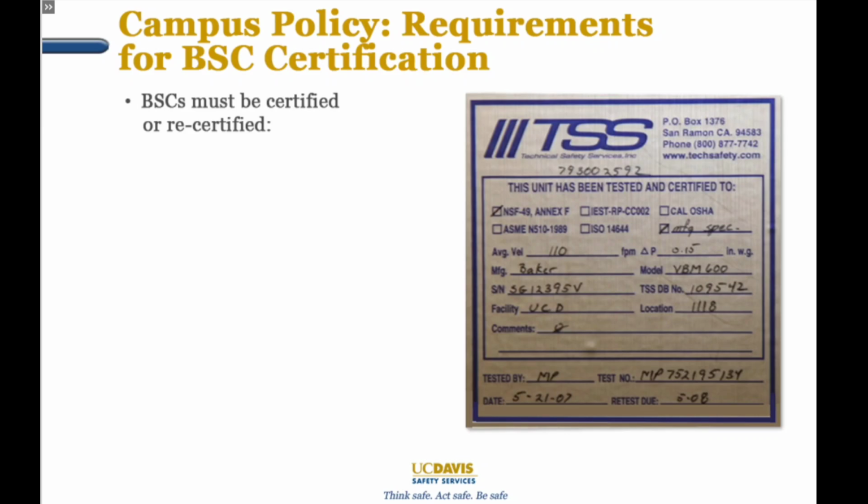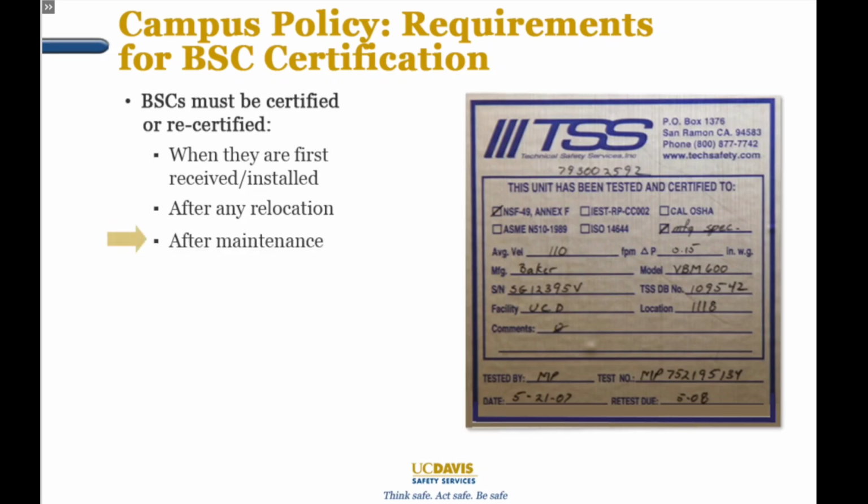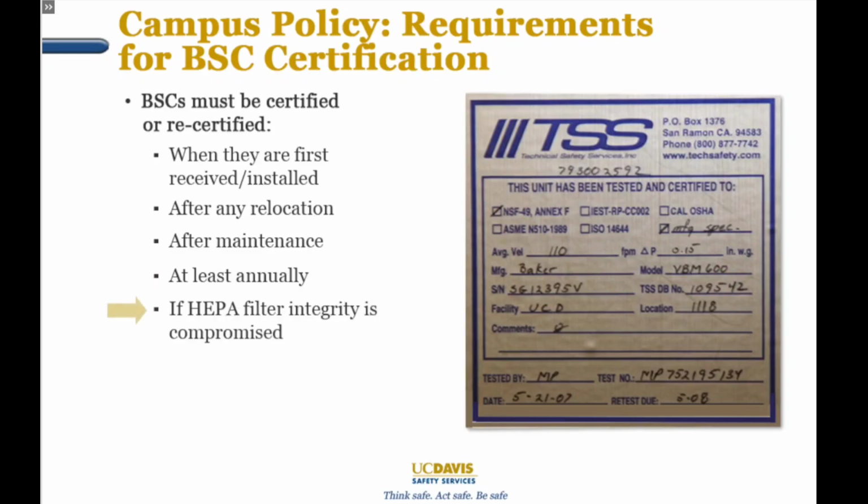According to campus policy, biological safety cabinets must also be certified at regular intervals by an accredited technician in order to be used for biohazardous materials. There are specific instances when the BSC must be certified. These include upon initial receiving and installation of a new BSC, after any relocation of a BSC, after maintenance on the BSC, at least annually, and if the HEPA filter integrity is thought to be compromised, for example, after a major spill. Contact the Biosafety office when you think this is the case.